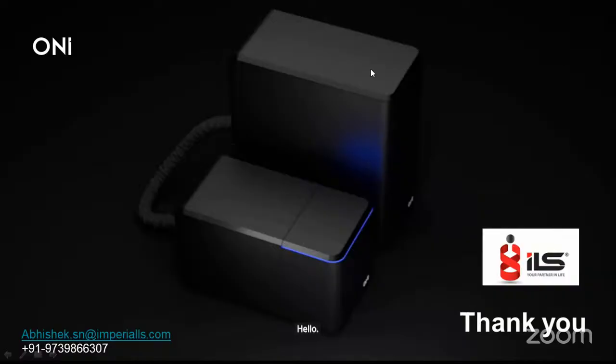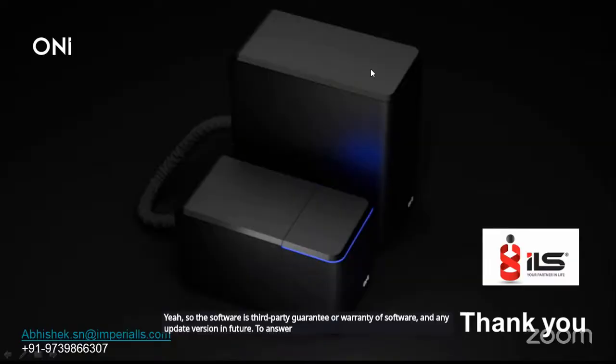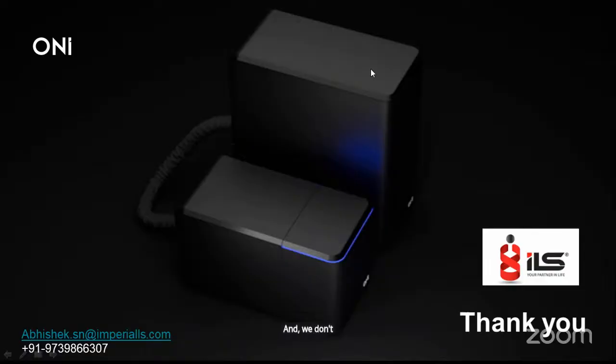Yeah. So the question is about the software: third party, guarantee or warranty, and any updated version in future. To answer this question, the software is our own software, so there are always auto updates. It is cloud based, so you don't even have to update the version of the software. It automatically gives you the newer version because it is a cloud based enhancement.